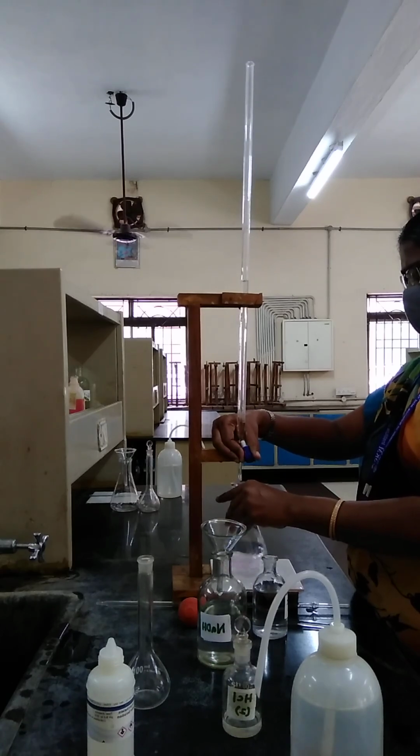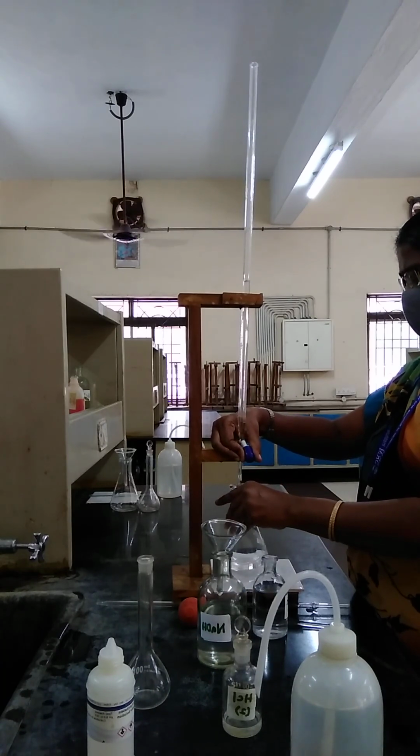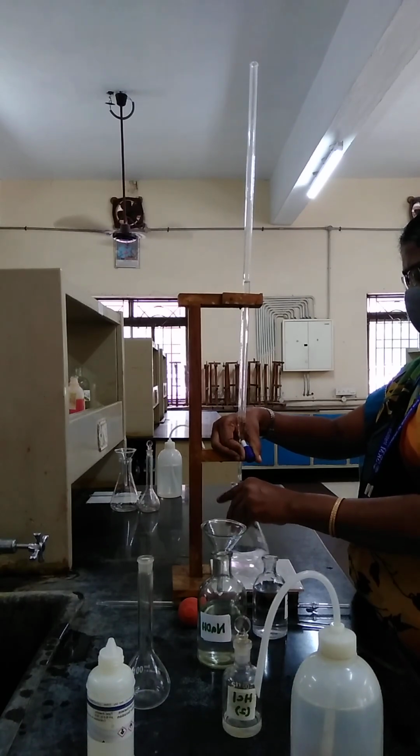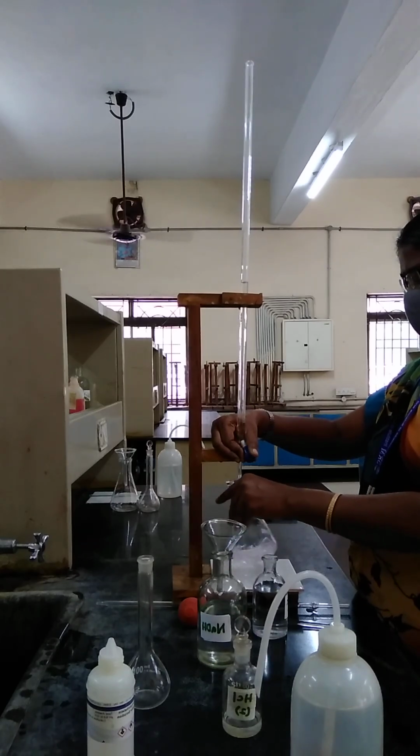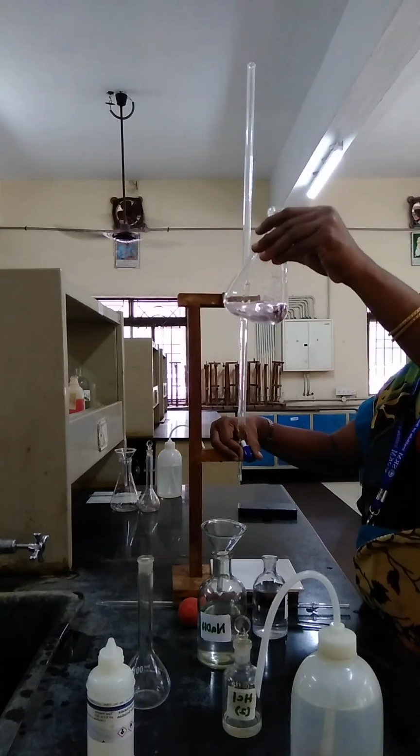Now it's going to reach the end point, slowly doing the titration against the NaOH. So it's on the way to the end point. Yes, it's a light pink. You can see the visibility, right? Very light color.